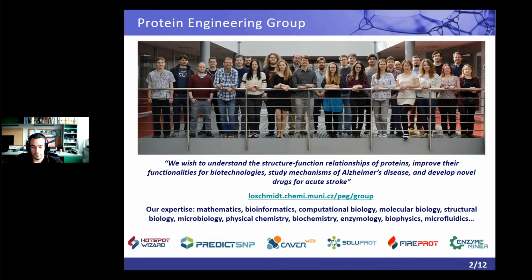You have already heard several presentations from our group, and this is the protein engineering group. So we are a part of FNUSA ICRC, but also Masaryk University. Typically, people in our group develop a lot of different tools to assist bioinformaticians, to assist people working on proteins and enzymes in all domains, but CalFitter stands out a little from other tools, primarily because it is aimed at experimentalists, not people with some programming or computer science background, but people who actually go to the lab and perform measurements. So it's a much more challenging group of target users.